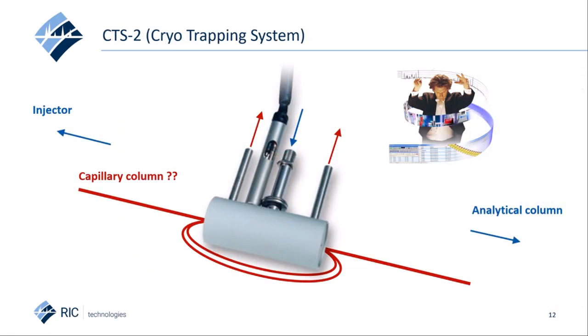Main advantages of having the refocusing of the volatiles is the ability to inject in splitless mode, immediately increasing the sensitivity of the method with a factor 10. Besides this, we eliminate the contribution to band broadening of the headspace injection, especially for the very volatile compounds eluting fast. Again here, at the same time, because of the sharper peak shape obtained, sensitivity increases also.